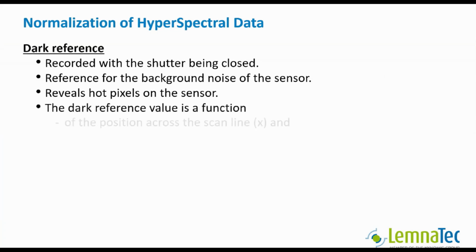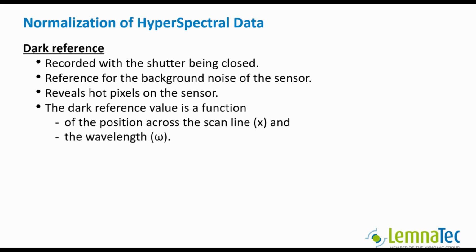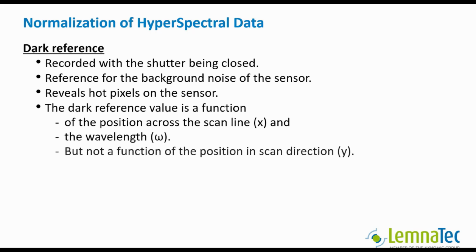It varies with the position on the scan line, X, and the wavelength, omega, but is the same for all positions along the scan direction, Y.